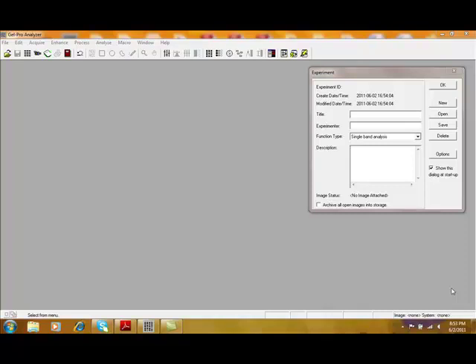This is a short movie showing GelPro Analyzer version 6.3 and how to analyze DNA gels.